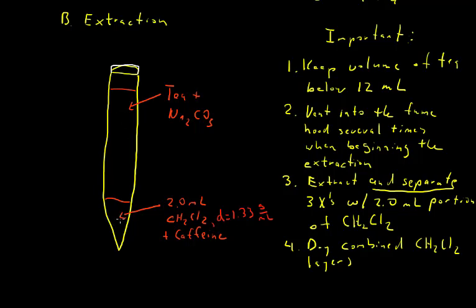Now remember, the tea is going to be very concentrated, and so the density of the tea is going to be greater than the density of water. You always have to be careful when you're doing extractions not to throw any of the layers away until you're absolutely certain you've got what you want. So don't discard any of the layers until you're done with the experiment, really.